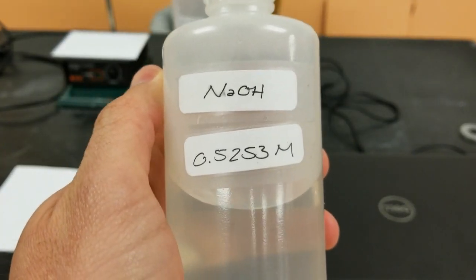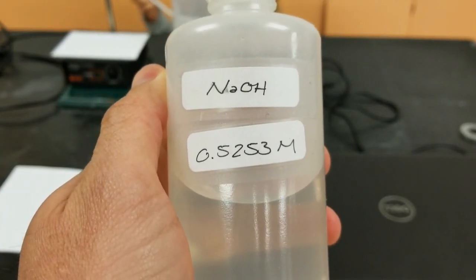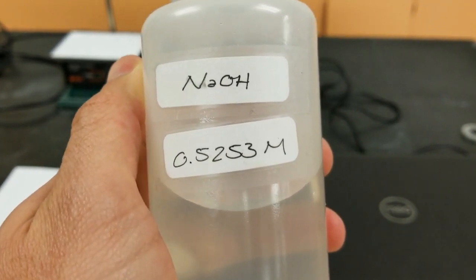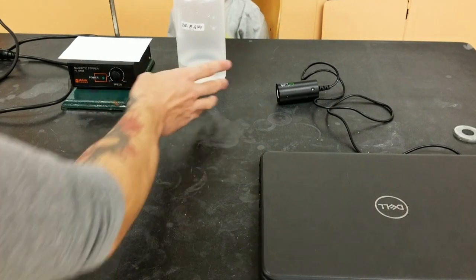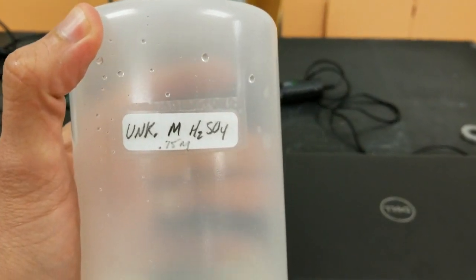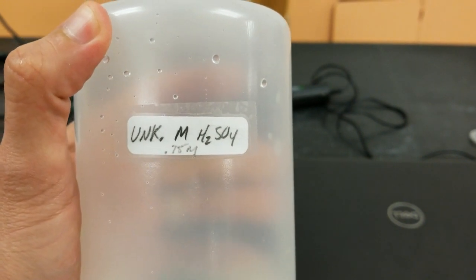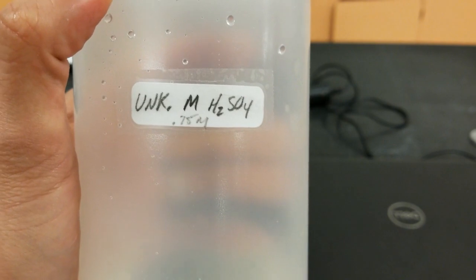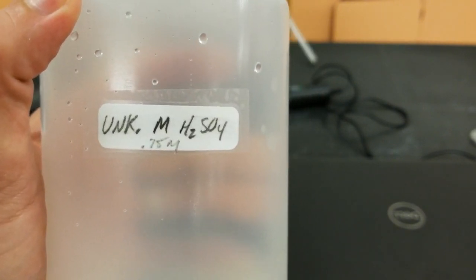So in this reaction today, this is the base that we're using. We know its concentration with high precision. This is the sulfuric acid that we're going to be using. We know its concentration is approximately 0.75 moles per liter, but we're going to confirm that or find it with better precision.